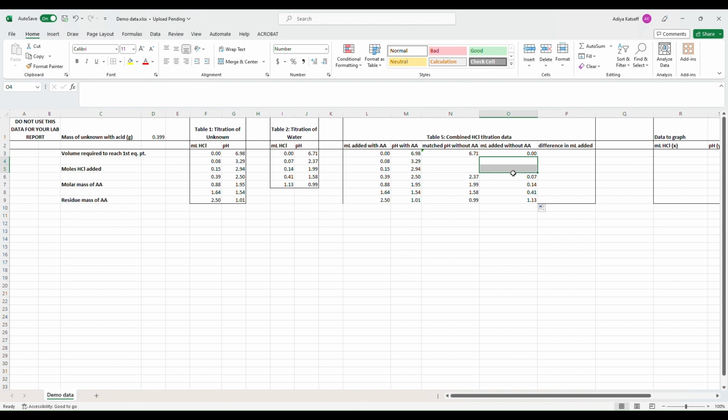A pretty simple way to do that is to calculate them as other points on a line. So what's our formula for a line? Hopefully you remember a line is y equals mx plus b, where in this case we're going to make x equal to the pH, and y equal to the volume, the mLs added. The reason we're doing that is just because it makes our lives easier. We're trying to fill in the gap in the mLs added, and since it's a y equals kind of equation, it's nice to make y equal to the thing you're trying to solve for.